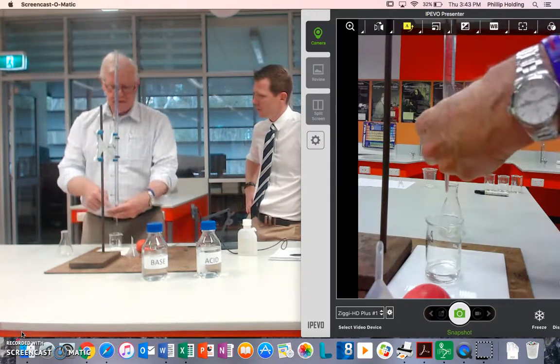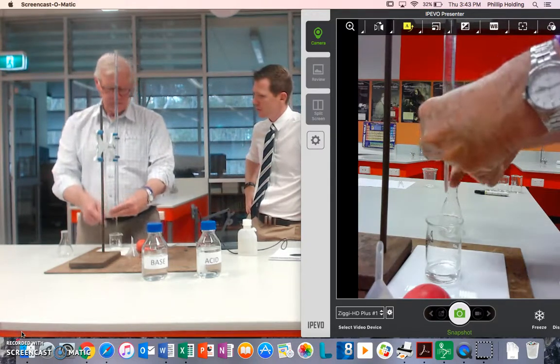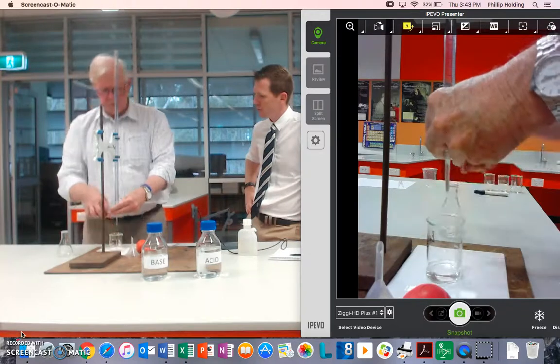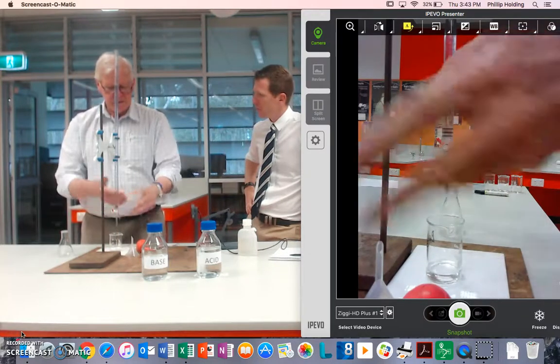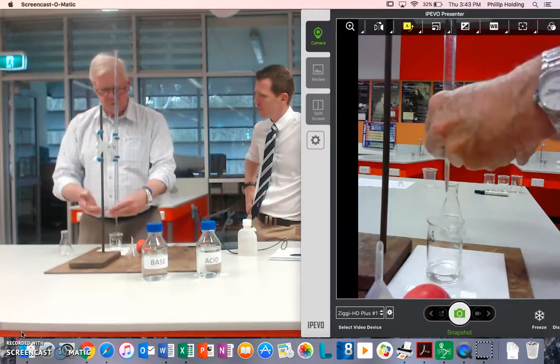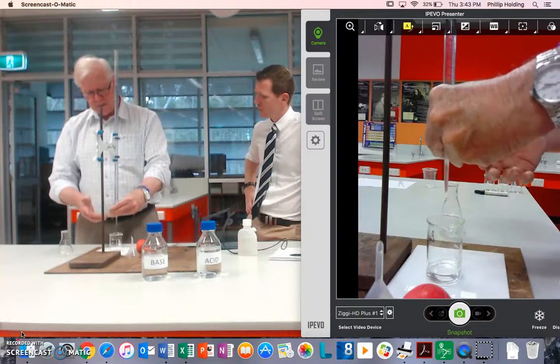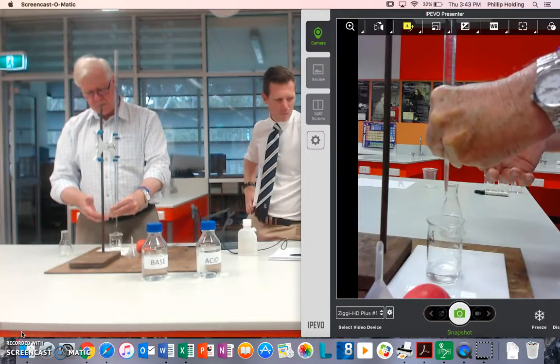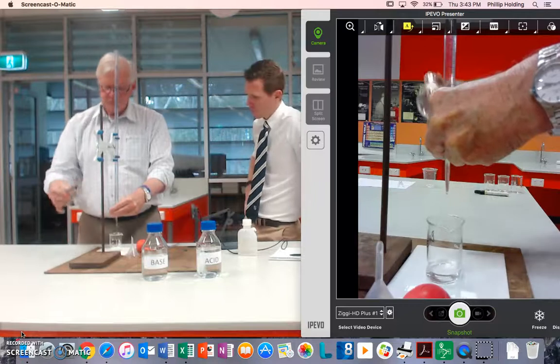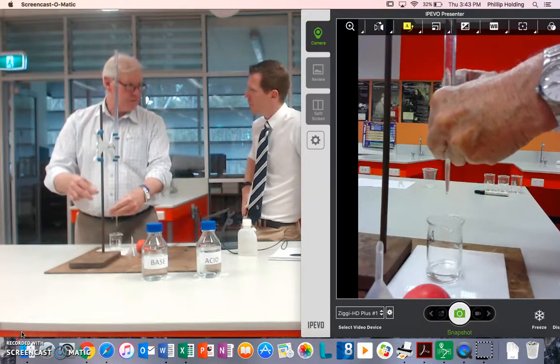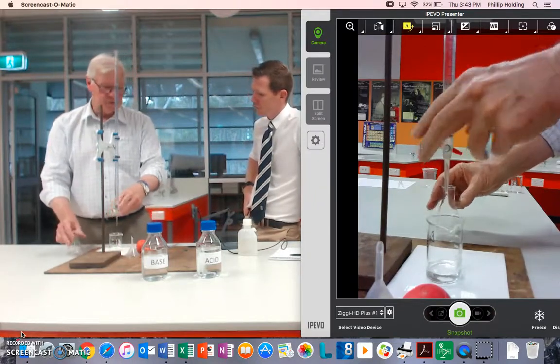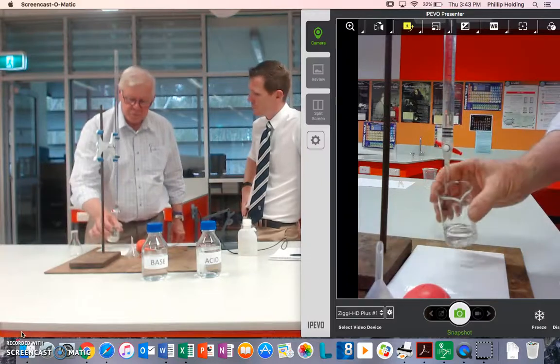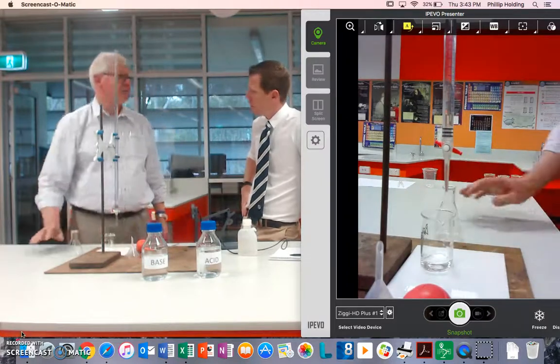It wouldn't matter as long as you're comfortable and you've got control of the tap. This way, I can see what's happening to the handle, and I'm looking down as well. So it doesn't matter, left-handed or right-handed, as long as you've got control. And this way, I can control the tap, and because I'm right-handed, I can swirl that comfortably. Okay. That's my method for doing it, but as long as whatever you're doing works, it's all right.